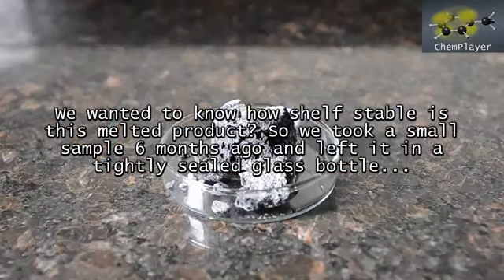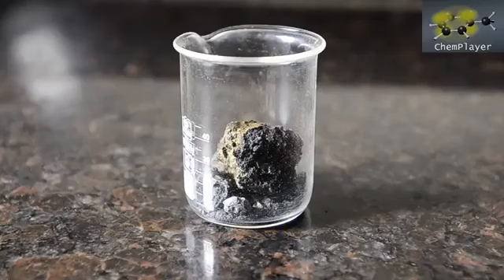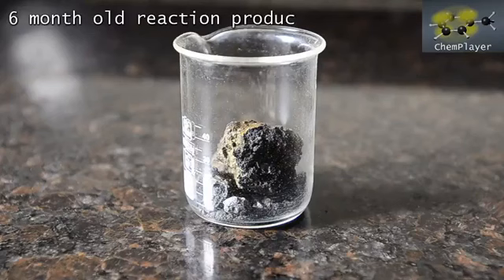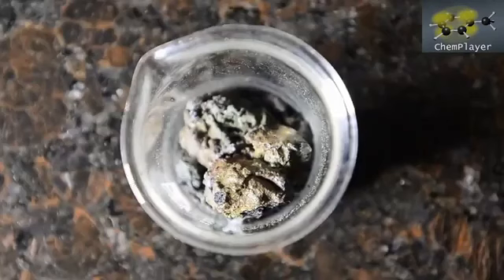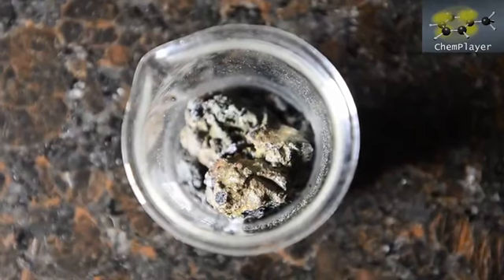So let's take a look at that previous sample now. Here it is. We made this in exactly the same way 6 months ago, and then stored it. When we opened the jar there was a faint aroma of ammonia, but not much else apart from a subtle background aroma of HCN. It's got a yellow-brown coloration to it, so the iron produced in the reaction may have oxidized to its brown-colored oxide with the air present.